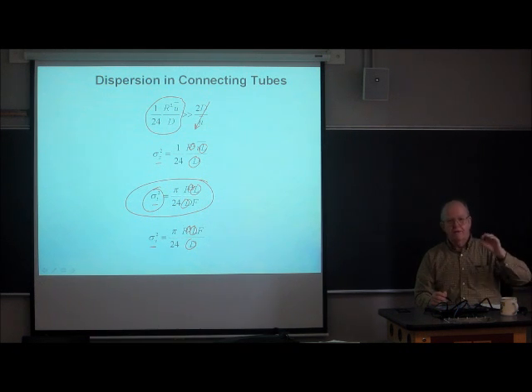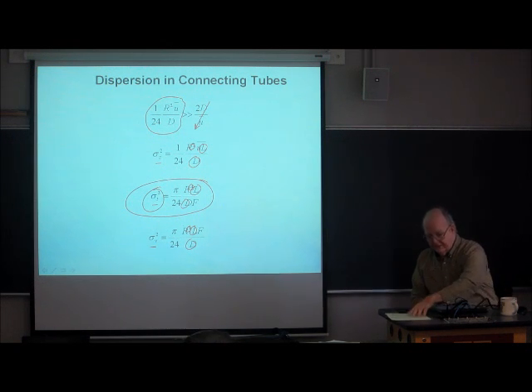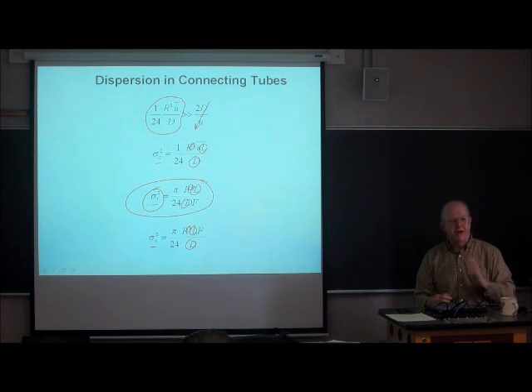And so if you went from 0.01 tubing to 0.005 tubing, it would go down 2 to the 4th power, which would be a factor of 16. And it would be completely and totally negligible. A small change can have a humongous effect on extra column band broadening due to the passage through the tubing, because of the damnable Hagen-Poiseuille flow. That's all that's going on here.